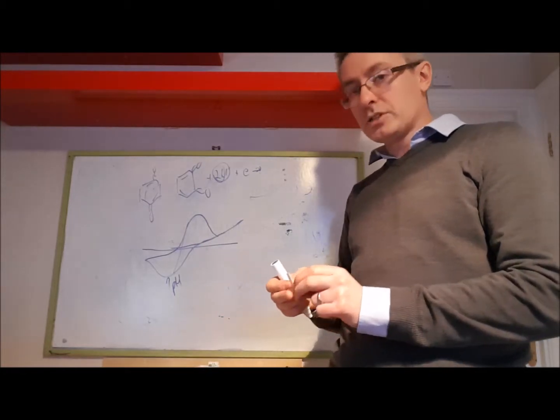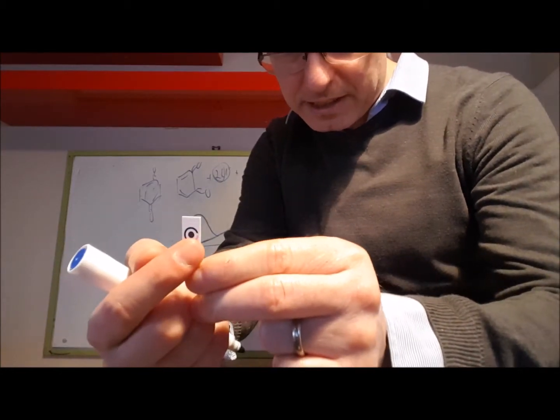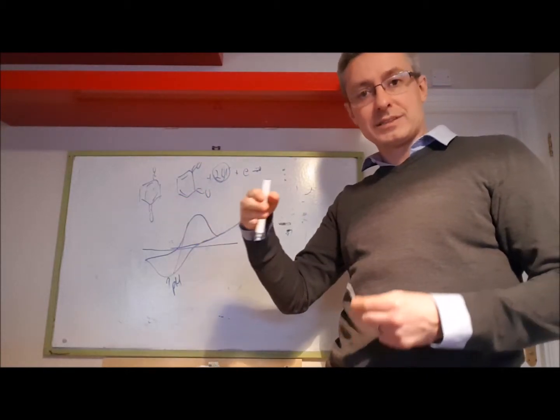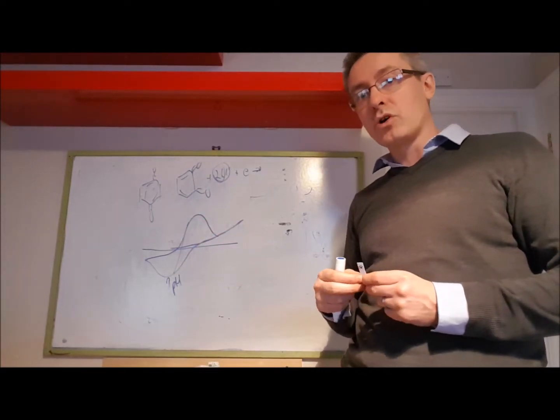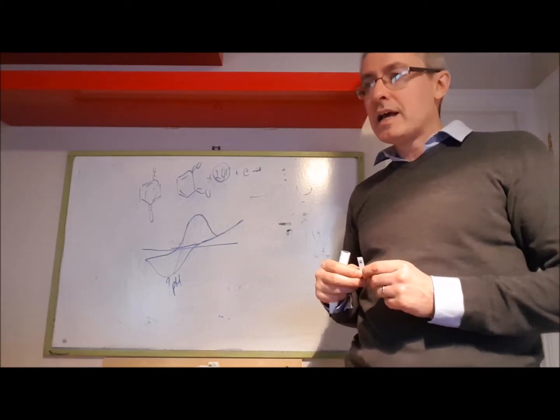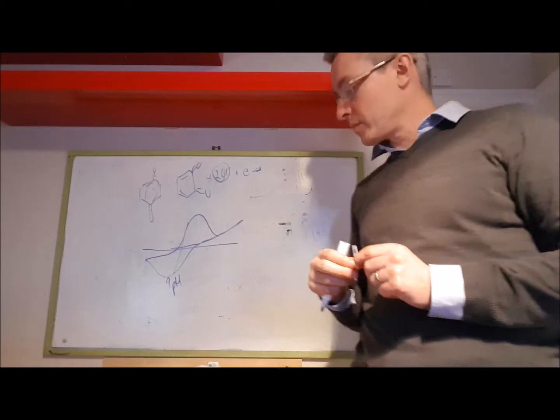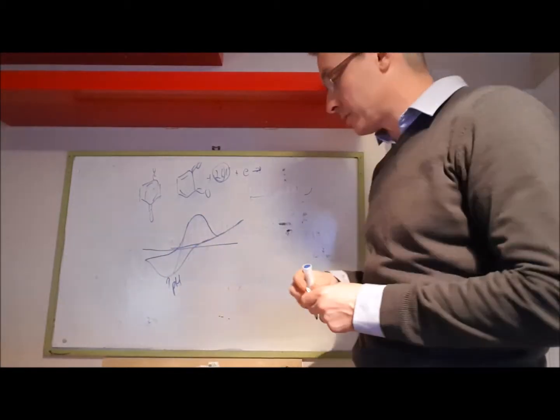Now, people would say to you, the problem with these is that there's a reference electrode on there that is silver chloride, but of course you're running silver chloride in oil, so there's no chloride around there. So that reference electrode is not in its native environment. It's not going to behave the way you would expect. It might be good enough, but there's a lot of mights in here. You have to try things out. That is my comment. You have to try. If you don't try, then there's no point.